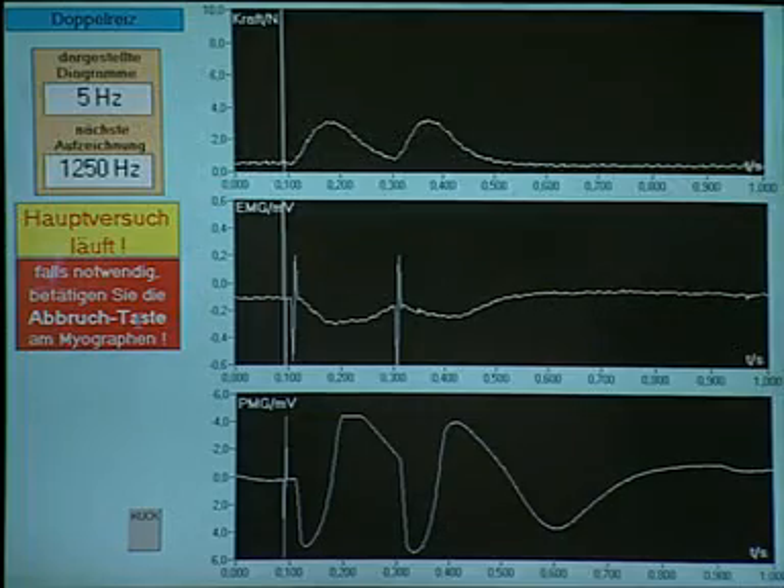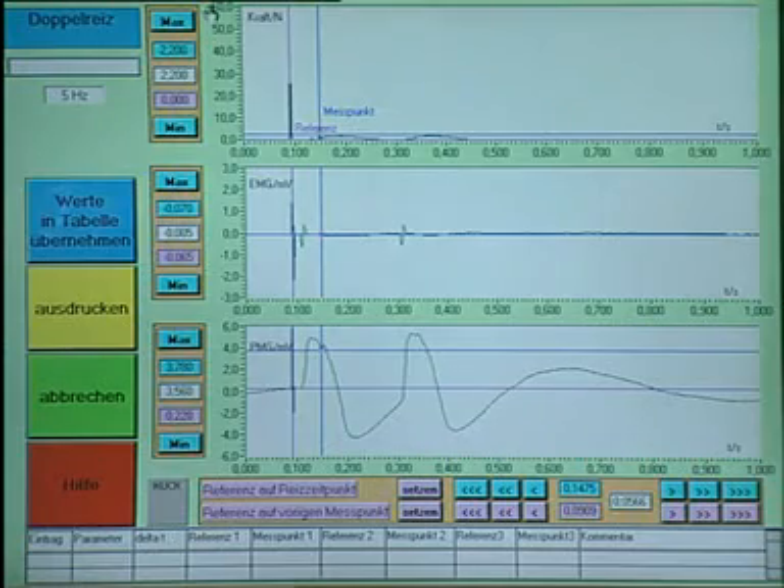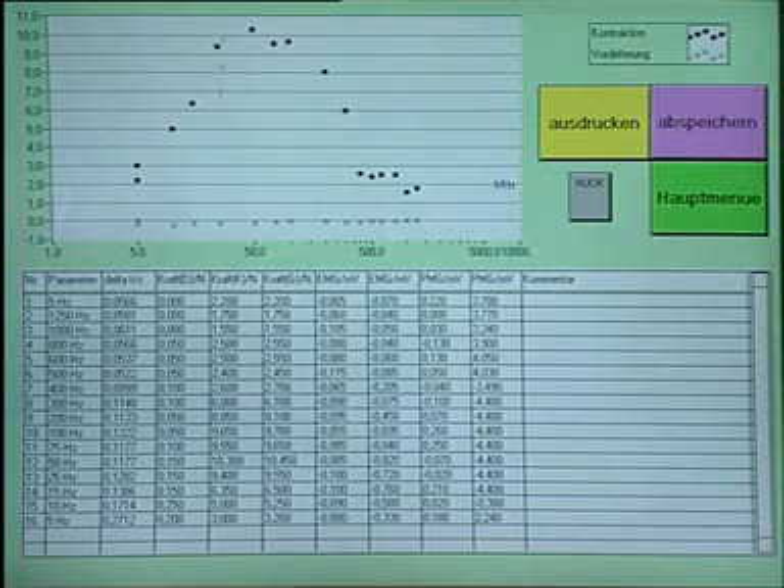In the computer program evaluation, you have the possibility to analyze the complete results of all reactions of your body. The results are absolutely identical between biological use with a dead frog or a human self-test with the myograph.